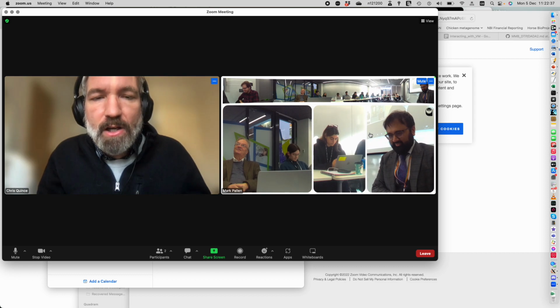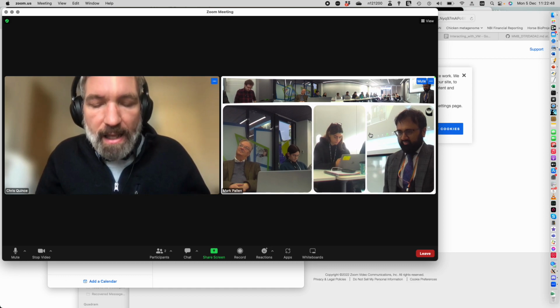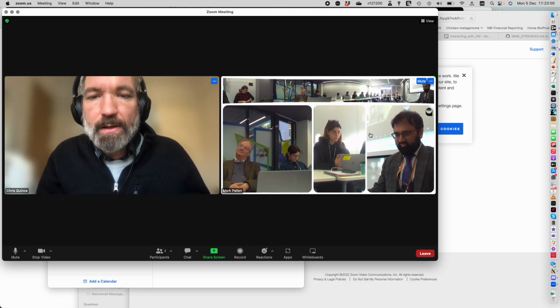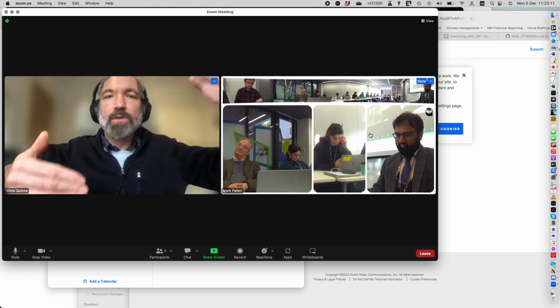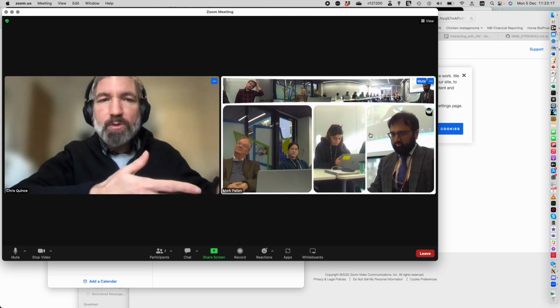Every time I talk to a group of collaborators about how to do their microbiome sequencing, they will say to me, "Do we need to even bother doing 16S because we're doing shotgun metagenomics?" And every time I say yes. Why not do 16S as well? Because you will still get the community to more depth, because you're only targeting one gene. So with a relatively small number of reads, you can get a greater depth of community profile than you'll get from metagenomics.